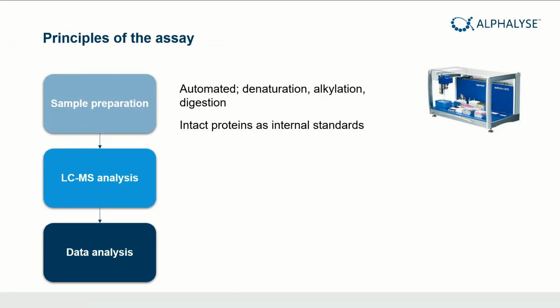So the whole sample preparation we have set up in a pipetting robot from Eppendorf. It has about 97 different steps over 6 hours. So it has digestion, denaturation, reduction and alkylation of cysteines, and all these complex steps to take into account this variability.